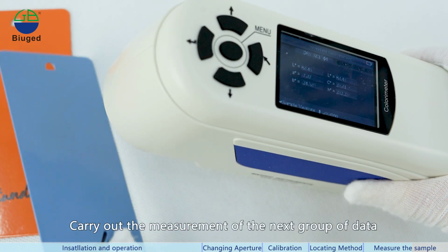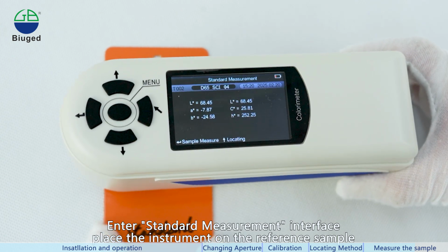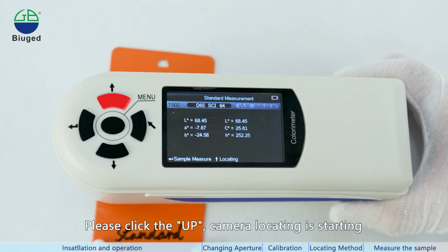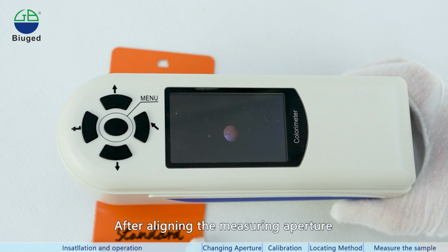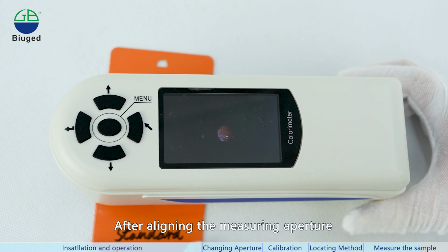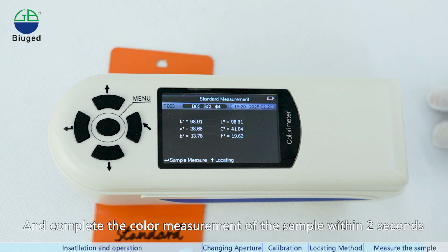Carry out the measurement of the next group of data. Enter the standard measurement interface. Place the instrument on the reference sample. Please click the up button. Camera locating is starting. After aligning the measuring aperture, press the testing key and complete the color measurement of the sample within 2 seconds.